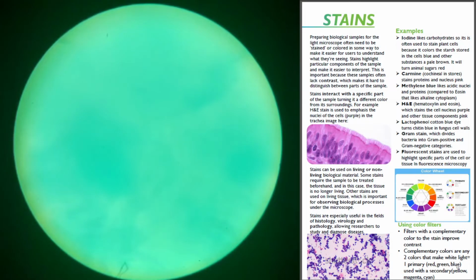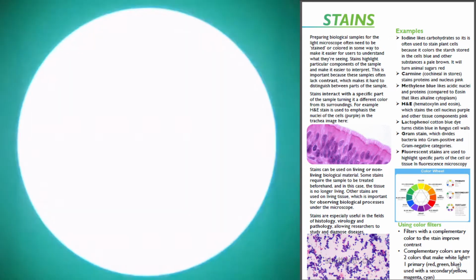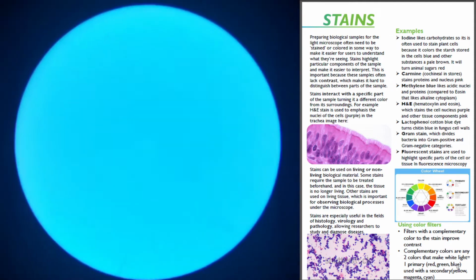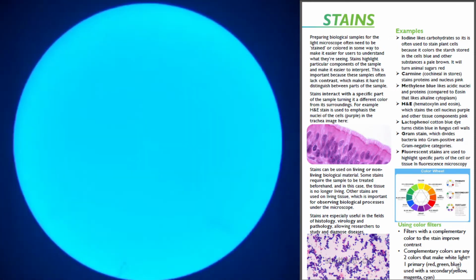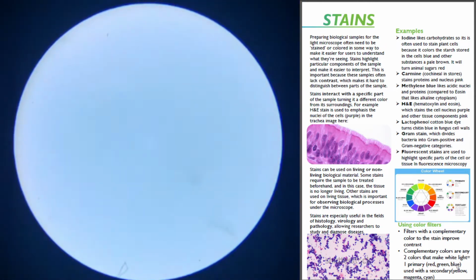Okay. This did not make it pop. I'm pushing down on the rim, giving it a little spin. Nope, still no pop. Might get unlucky with these. So the cells were already hard to see. Yep. We're out of luck on these. And I'm out of focus. Sounds like a country song, doesn't it? We're out of luck and I'm out of focus.